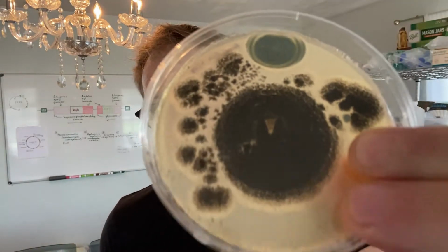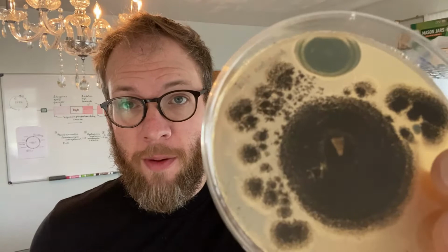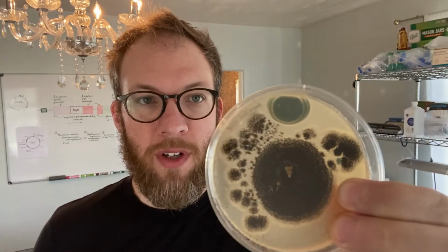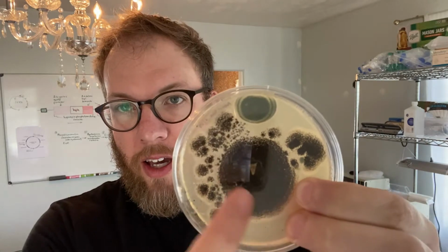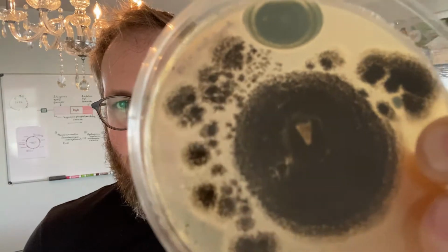I have some growing on a plate here. This is some aspergillus that actually grew in my local environment with a colony of penicillium here at the top. You might ask, how do I know that these are aspergillus and penicillium? Well, when you look at molds long enough, you begin to see certain phenotypes or characteristics of the organism that give it away. The telltale green color and the aspergillus, if you could see it up close, you'll see little dots. Those are going to be the conidiophores, which have a very characteristic look, especially under a microscope.